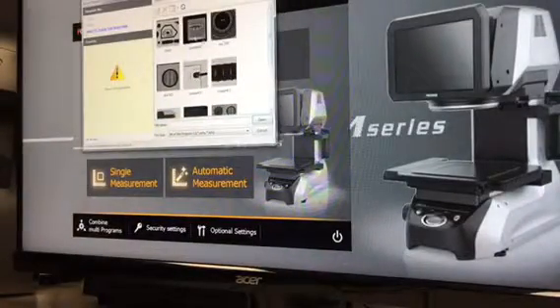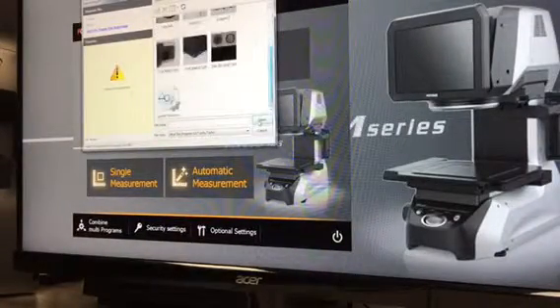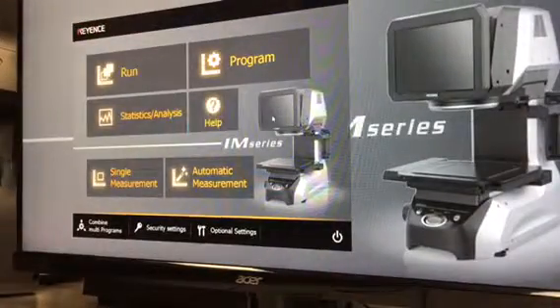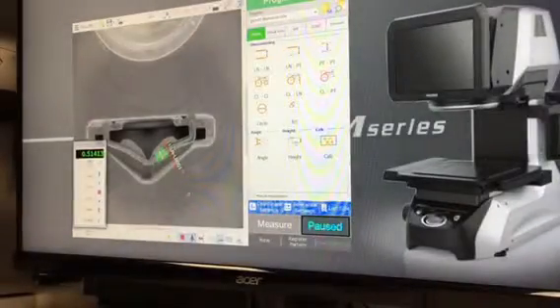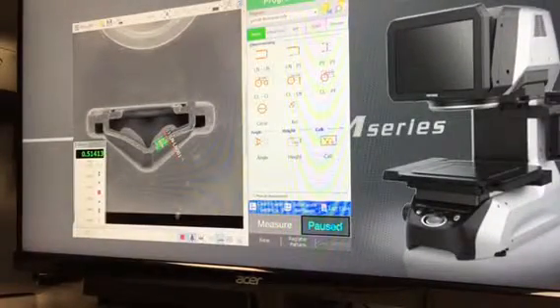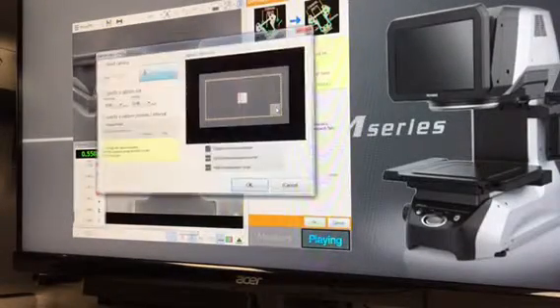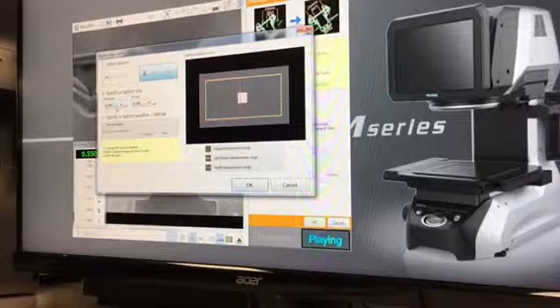So let's say for the Garrett thickness program, I wrote that and did all my optimum illumination and everything looks good. I can hit the play button, and then I can do capture condition changes.